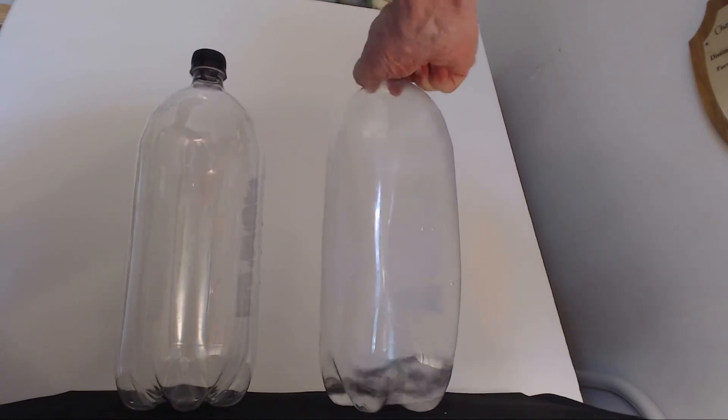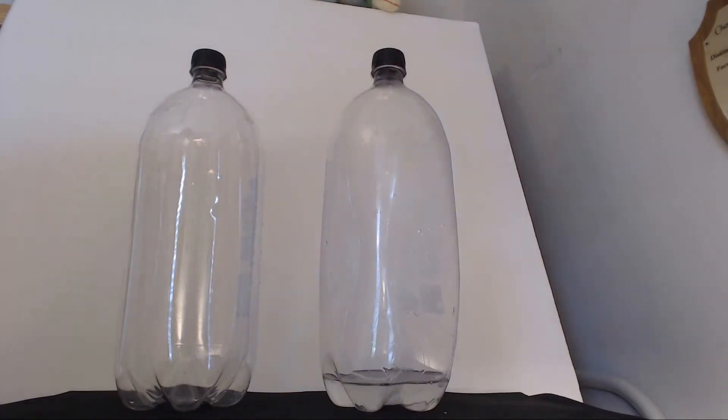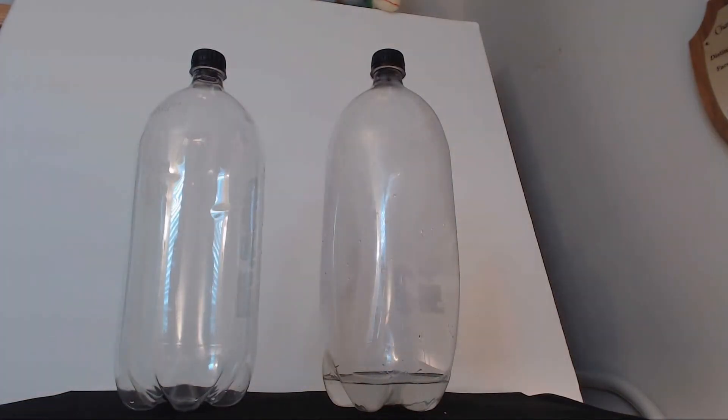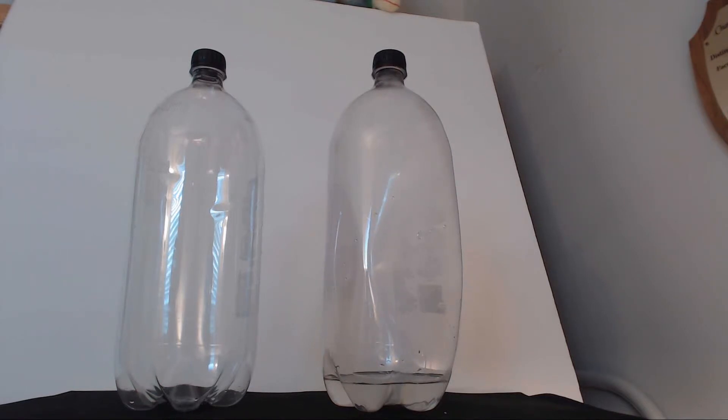Sodium hydroxide should react with the carbon dioxide, and we'll just watch it collapse as we pull the carbon dioxide out of the vapor phase and gas phase. So we're sequestering the carbon dioxide — changing it from carbon dioxide and sodium hydroxide to sodium bicarbonate aqueous.